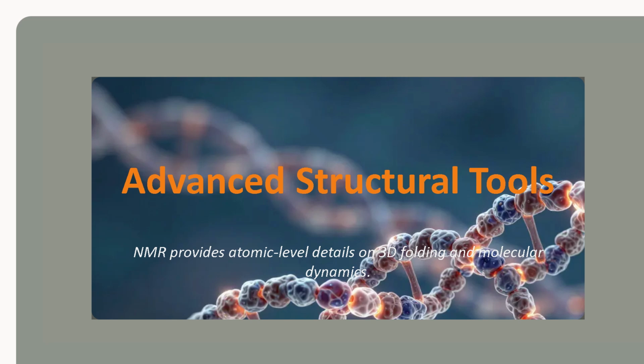This information is valuable for studying molecular dynamics, confirming structural stability, and ensuring that the peptide adopts the correct conformation necessary for biological activity.